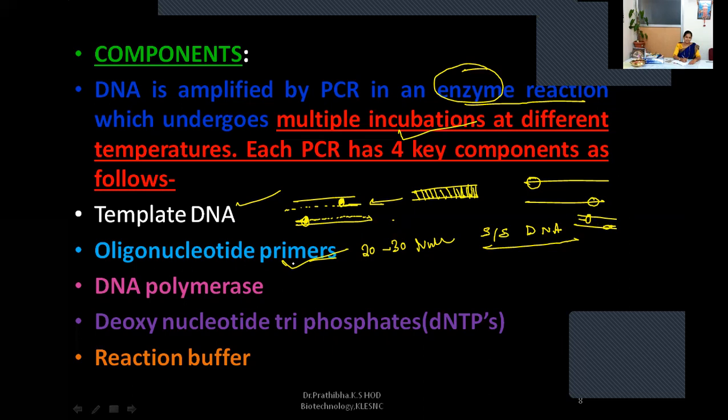To add some more information about primers, there are 2 types of primers. Do you have any idea? There are 2 types: one is the forward primer, and another one is the reverse primer.